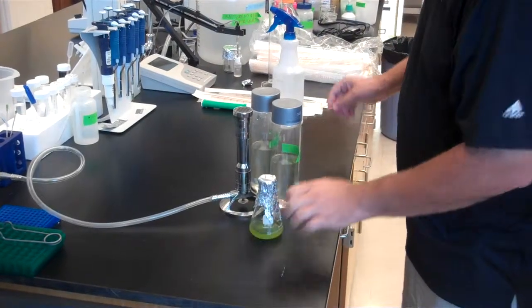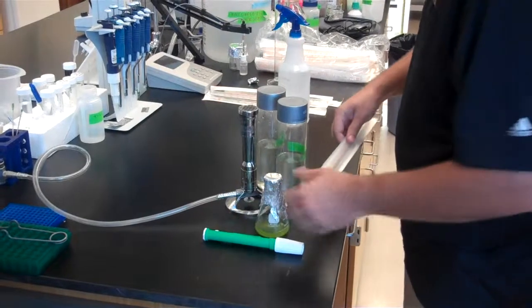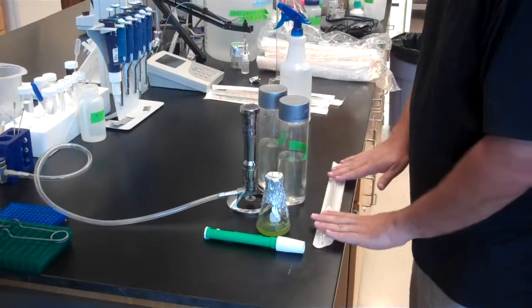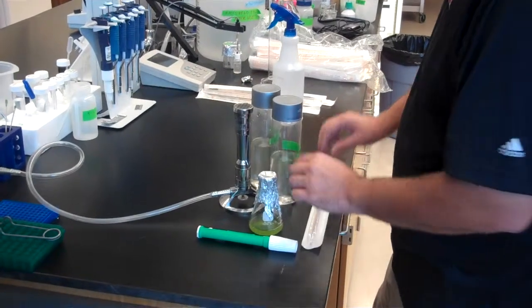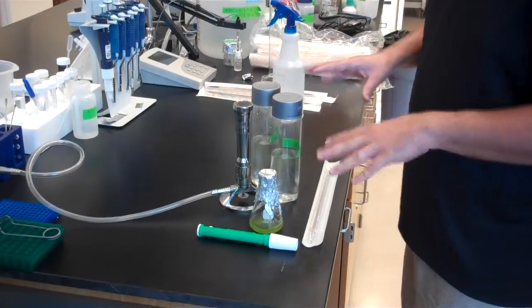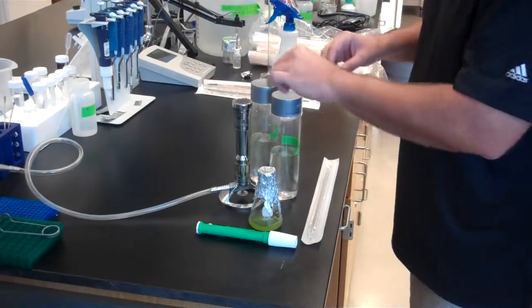Got my algae culture here. My hand crank pump, I'm going to put to the side, and I'm going to put this right in front. This is the 10 milliliter pipette. Okay, now that I know how I want to set everything up, I'm going to spray them all down with ethanol before I light the Bunsen burner.